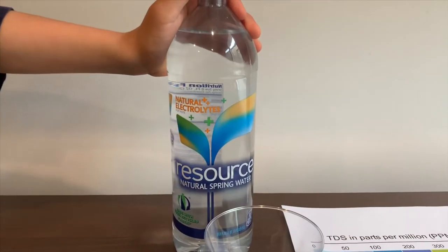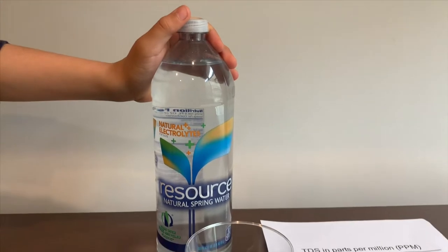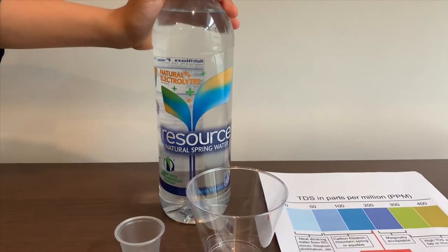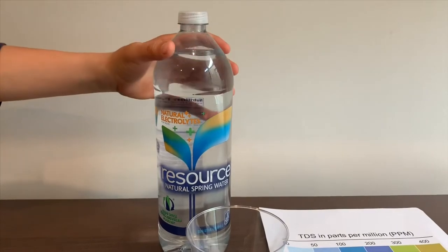This is Resourced natural spring water. It costs $1.69 and is sourced from different springs in California. It has electrolytes added for taste. Let's test the pH and TDS levels.